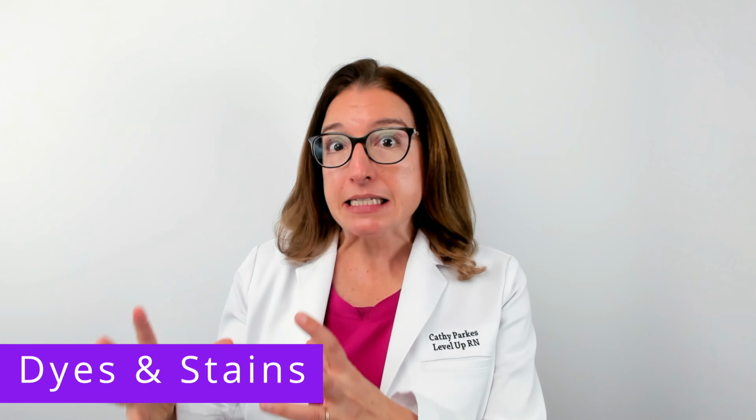Once we have prepared our specimen using fixation, we are ready to stain our specimen using dyes to make it more visible when we view it with a bright field microscope. So there are two types of dyes. We have a basic dye and an acidic dye.